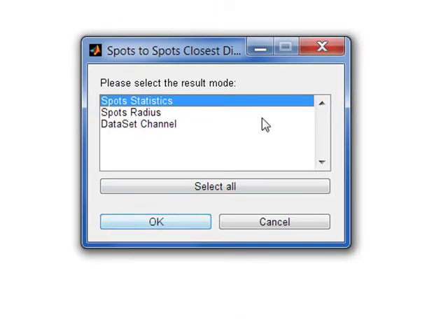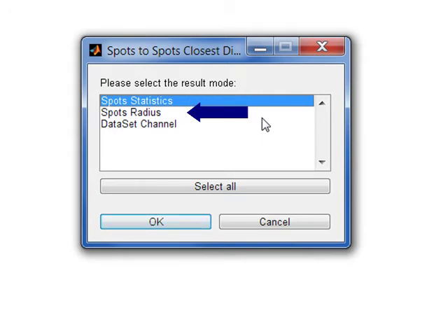There are three different possibilities of how the results can be displayed: new statistical values, new spots object, or new channel.